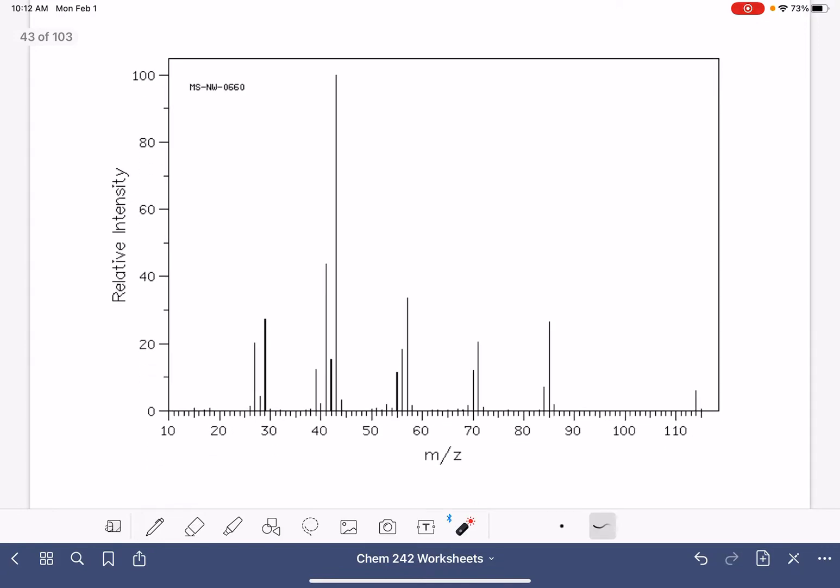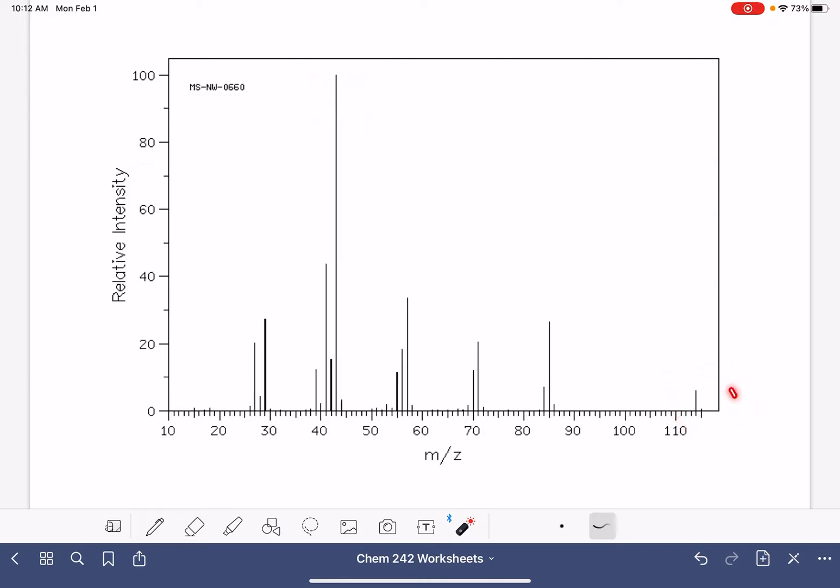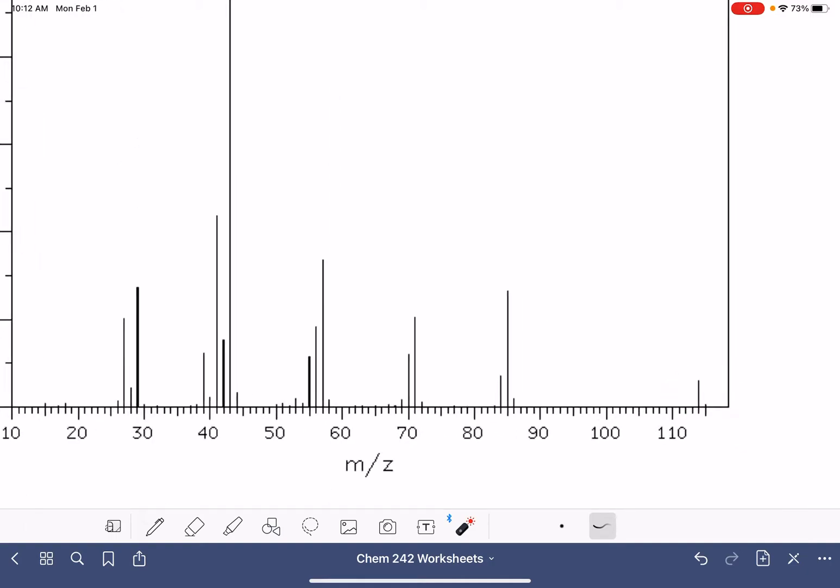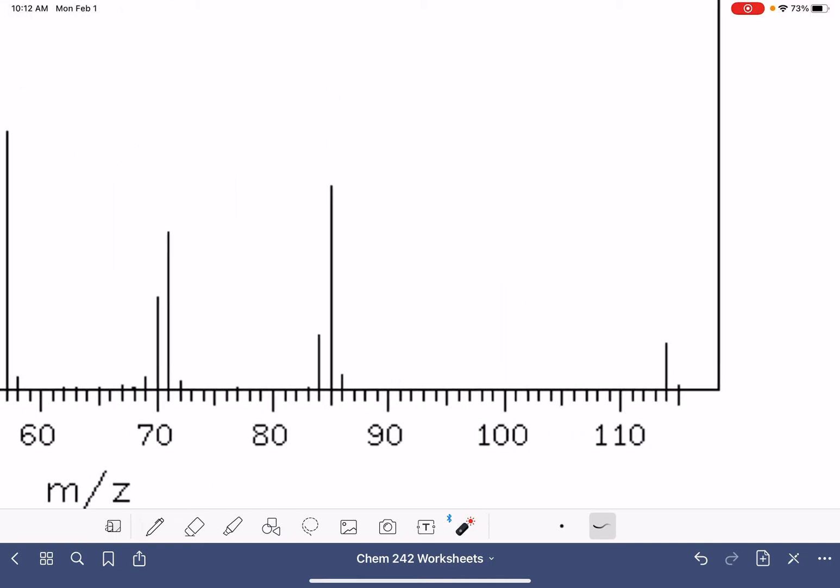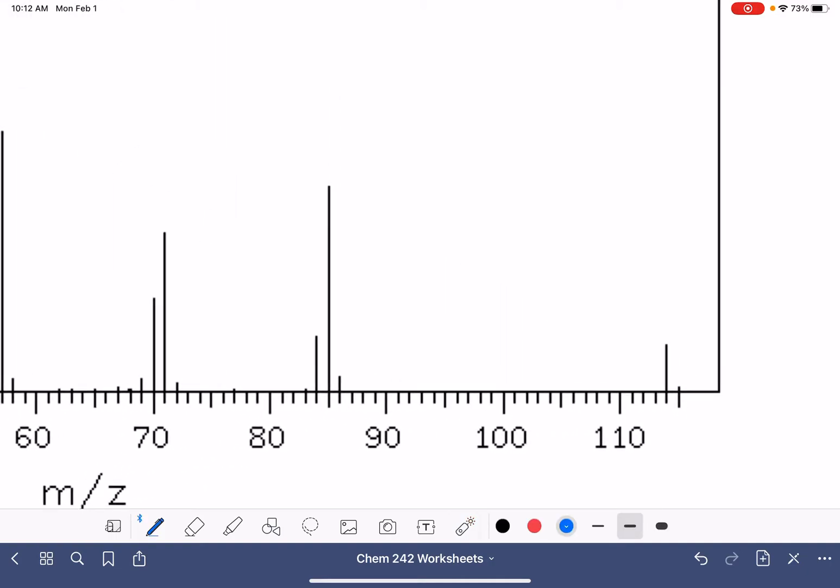Starting with the first spectrum, looking for the M plus peak. Remember, the M plus peak is not the highest peak. It is the peak on the right-hand side that has the greatest abundance. So we're going to go over to the right-hand side, focus on the peaks that are on the right-hand side, find the peak that has the greatest abundance. There it is.